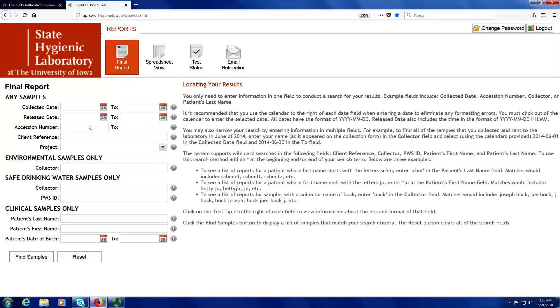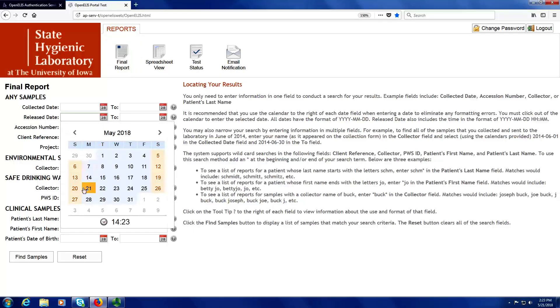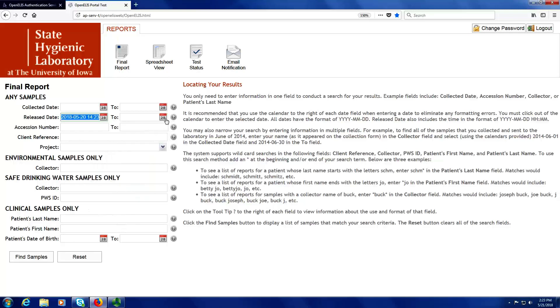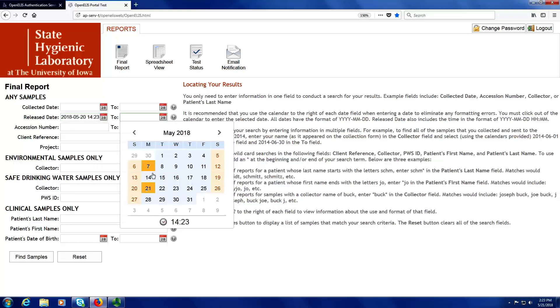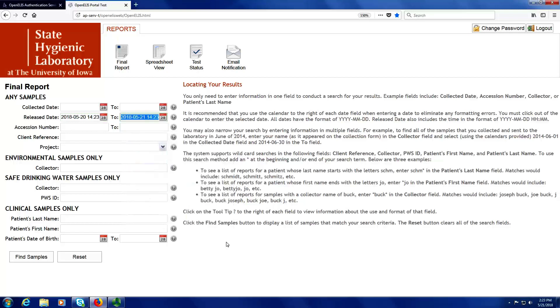Many hospitals will have someone search the database by release date from yesterday's date to today, and in that way they can download all the results that have been released in the last 24 hours. I can do this by clicking on the calendar to the right of release date and clicking yesterday's date. I have to click outside the calendar so that the date goes in the field, and then for the to field I can just click today's date. You'll notice that time is a part of the release date, so in this example I am searching for any results released in the last 24 hours.